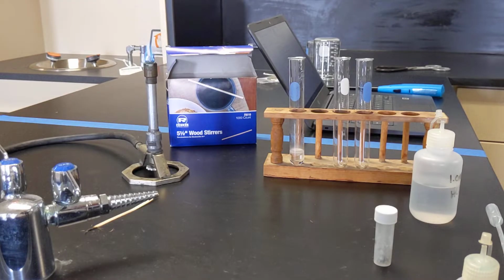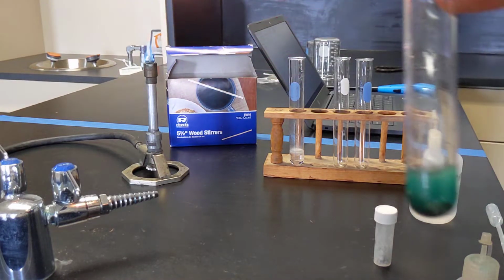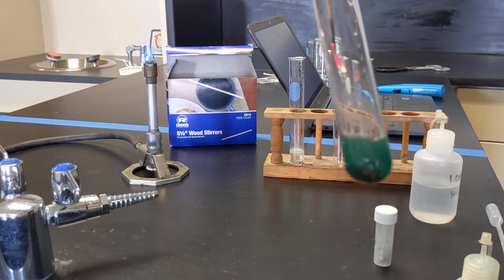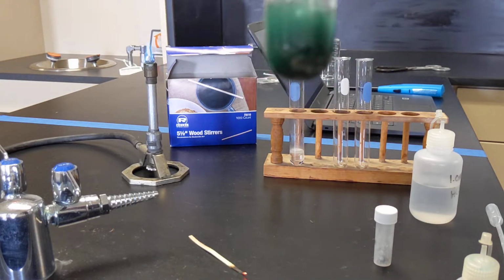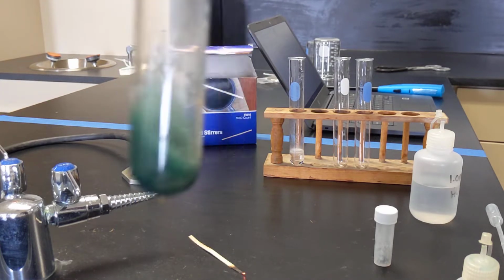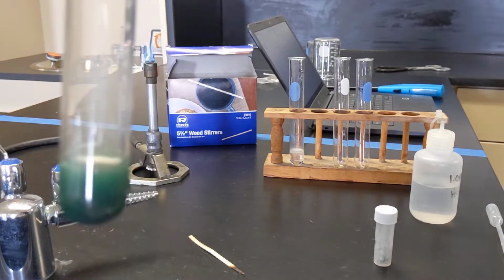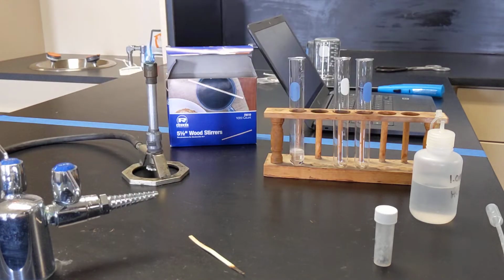Okay, we should probably see if this gas is something fun. Or what it is. It's not really doing anything. So hopefully you can see a change now. So remember, the copper chloride was this color before the reaction, and this is what's happened to it. And that's about it for that one.